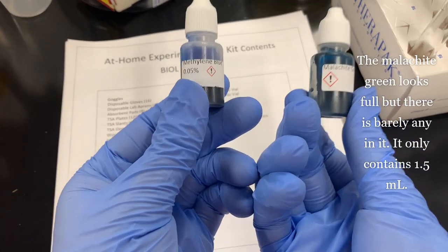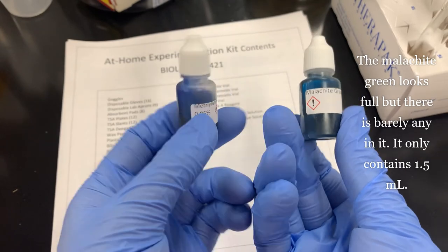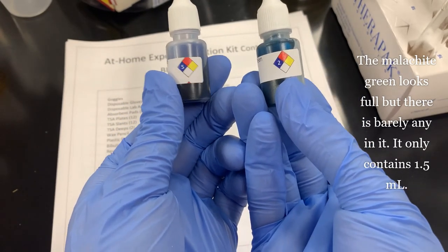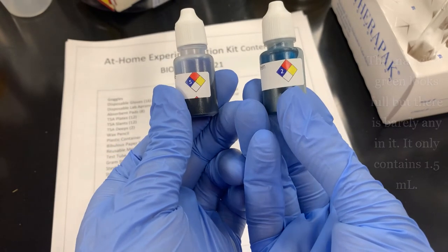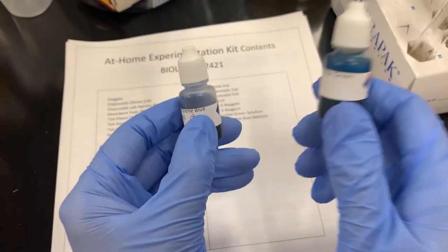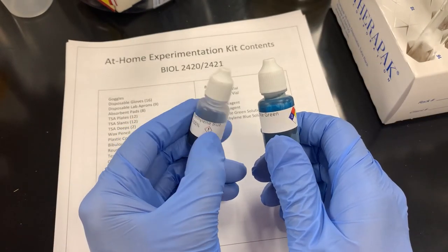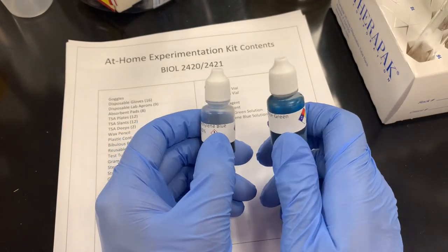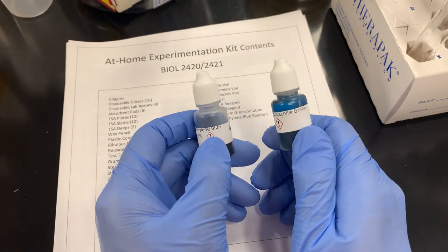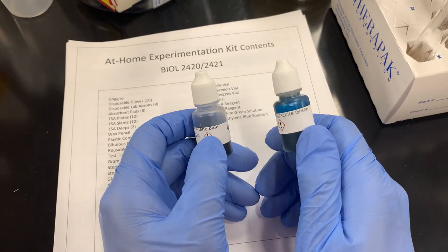You can notice that both of these have an exclamation point. That means that they are somewhat hazardous. The methylene blue has a number 5 in the health area, and the malachite green has a number 2. For the experiments we gave these to you for, you are going to use most of these. If these get on your skin, please rinse that area with water, flush it with water for 5 to 10 minutes, okay?